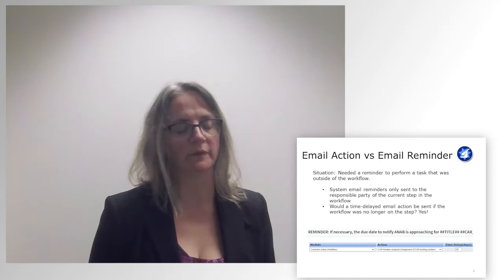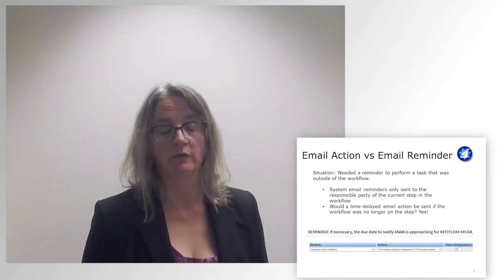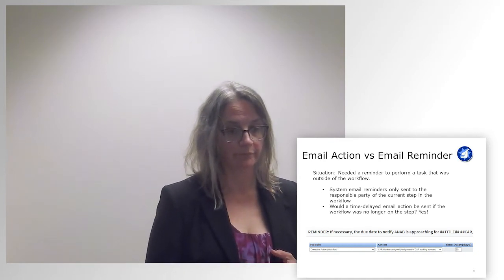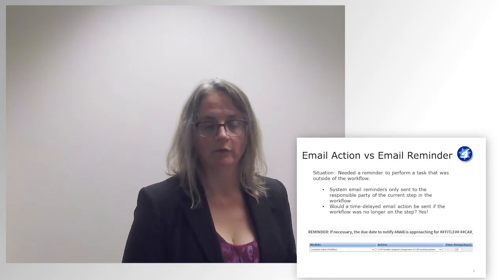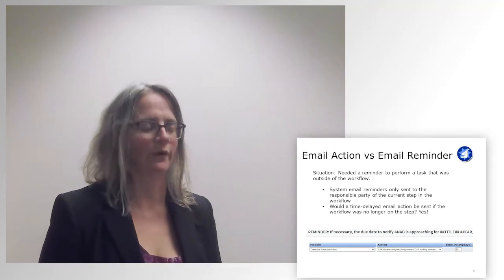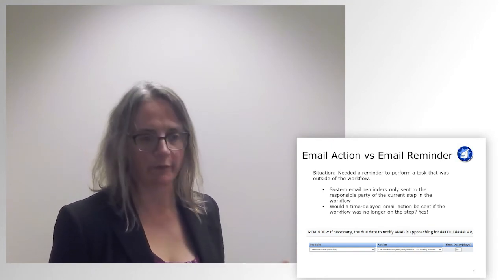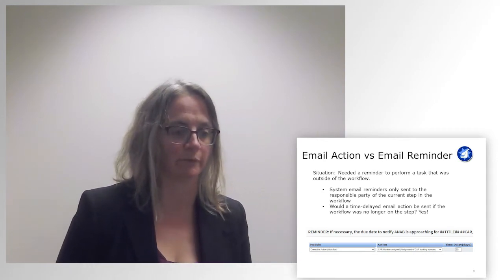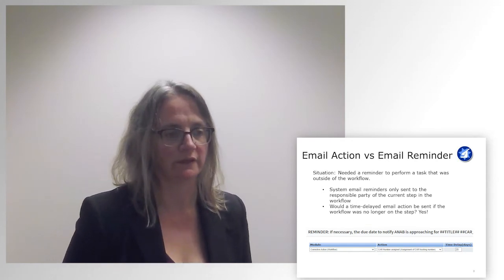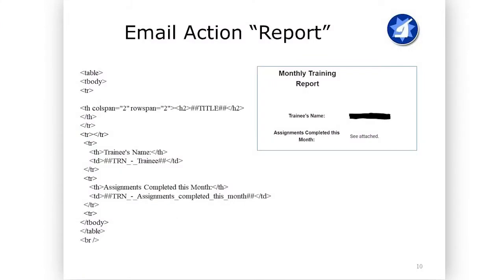So to go back a little bit, what we needed was to notify our accrediting body of a significant nonconformity within 30 days of when the corrective action was opened. So I set the email action up with a time delay of 20 days, and I put this on the route when the CAR number is assigned, which is essentially when our corrective action workflow is really started. Prior to that, it's more of an evaluation of whether or not nonconformity had occurred, and once that's been determined, a team is assigned and a tracking number is assigned. So we set it up for 20 days, past that to give the lab director and the technical services director a few days to get that email generated and sent if they haven't already done it, and if it even applies.